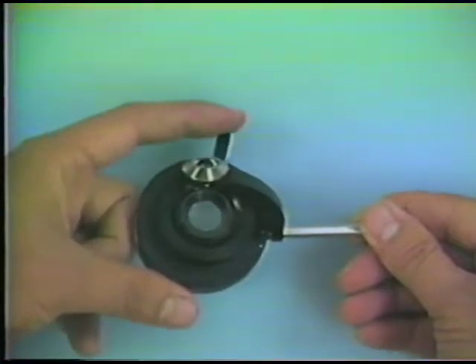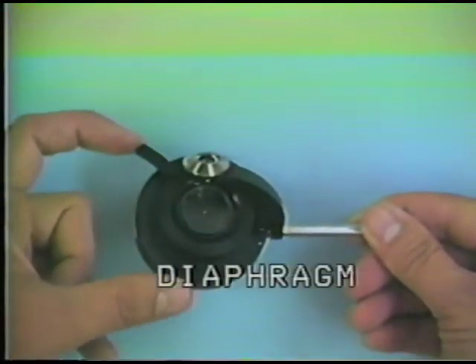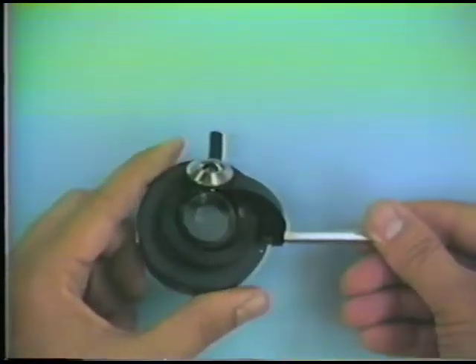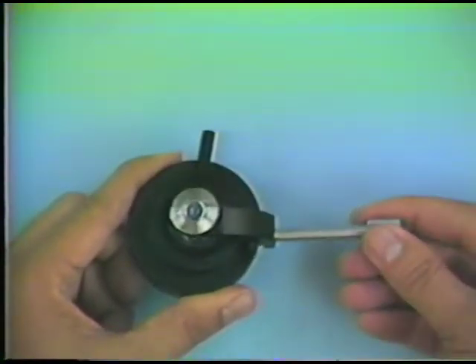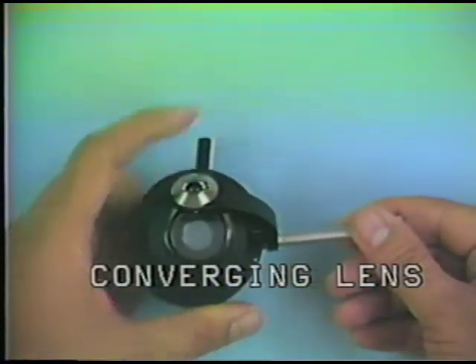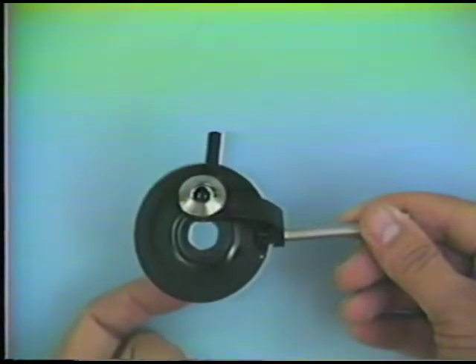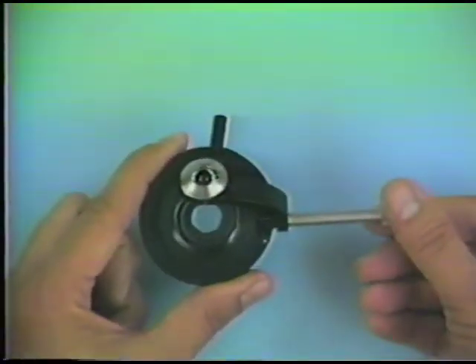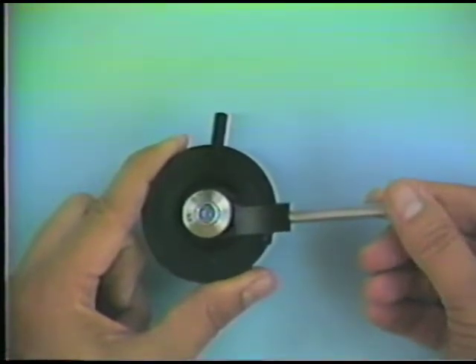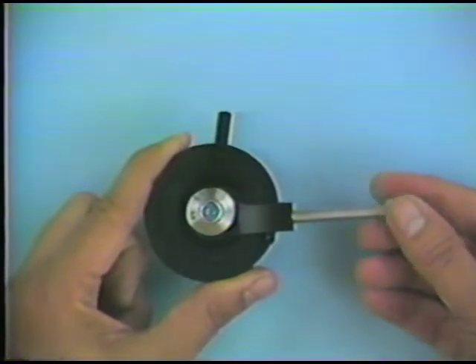There's a lower part below, which includes a lens and a diaphragm, which again you can direct the divergence of light in this sort of way. And there's an upper part which is called a converging lens, and this lens flips in and out, so you can have it either out of the field of view so that the light from the microscope source passes right through to the stage without interference of the converging lens, or you can flip this converging lens in, in which case the light is directed so that it forms a conoscopic kind of array.